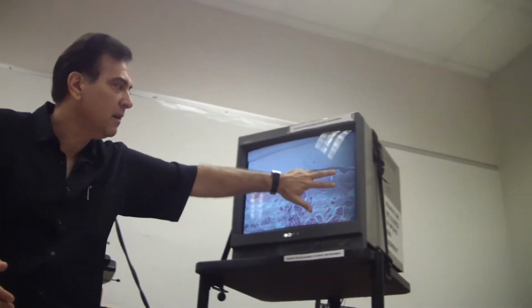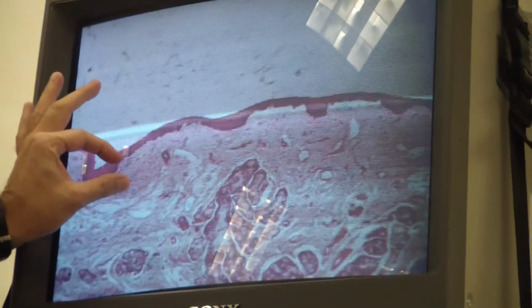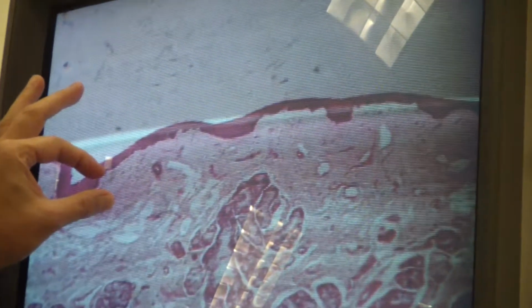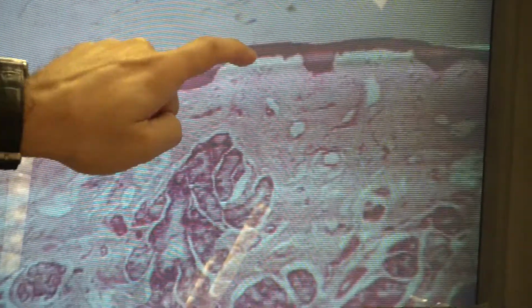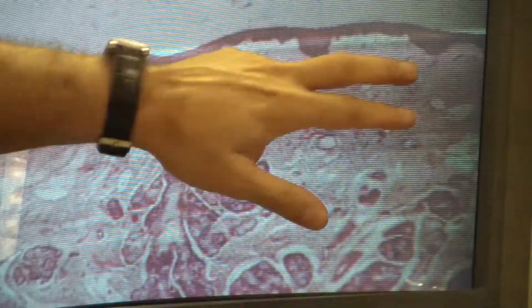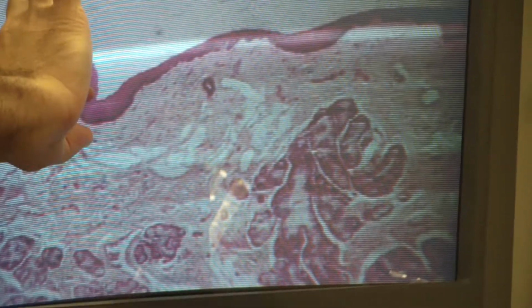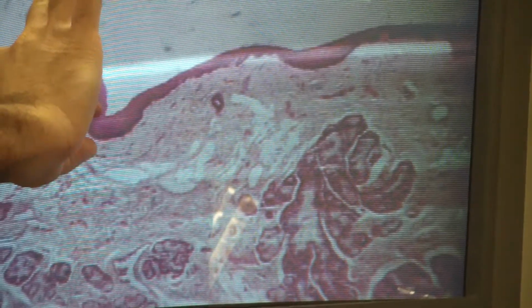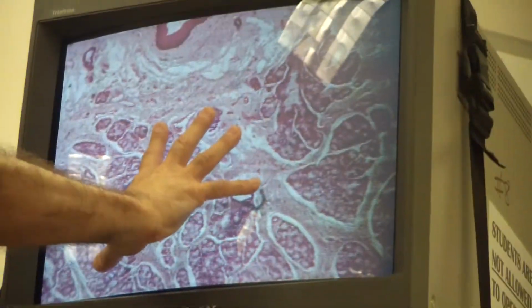You see, guys, right here, this stuff right here? See all this kind of light pink? That's the muscle. That's the muscularis mucosa. So this is the epithelium right here. In between, of course, you have lamina propria, and this thick layer of muscle that you see right here, that's the muscle. That means from here to here, that's the lumen. From here to here, that would be what? The mucosa. And then this is the submucosa.